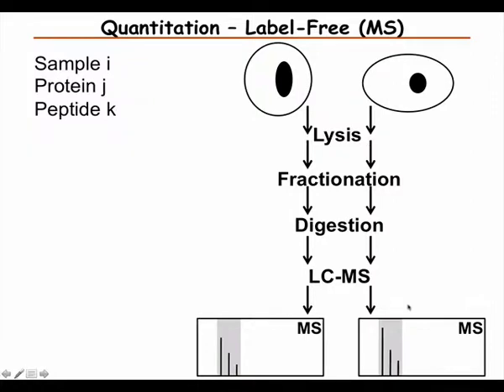But if we want to measure a lot of peptides, what we can do is to compare samples. So we get a relative quantity for the same peptide in different samples. So what we then try to do is to keep all the conditions the same and repeatedly measure first one sample, then the second, and then third, and maybe in the end many.